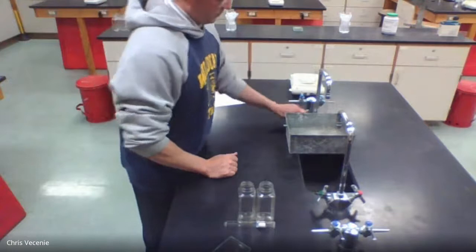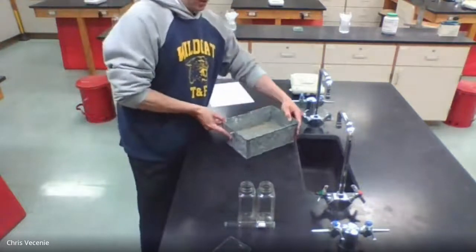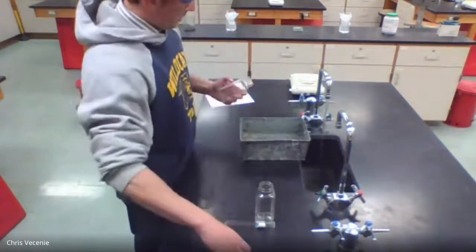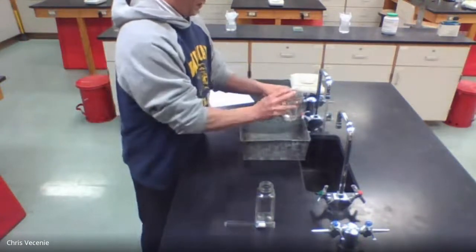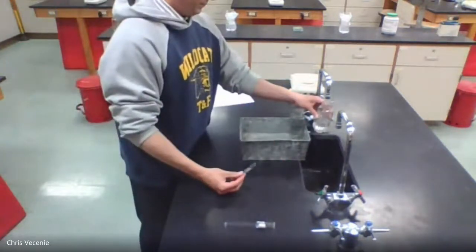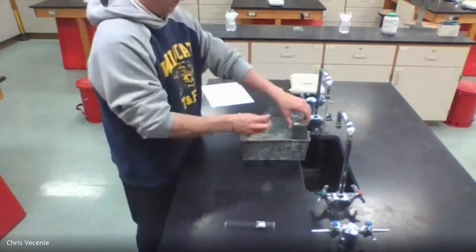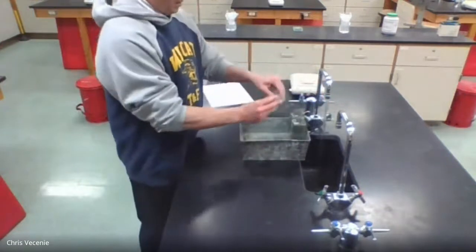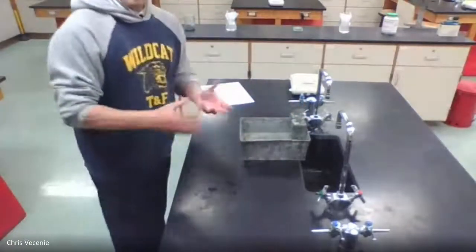So, just like always, I'm going to spin this trough around so that my release valve is facing over the sink. And then I'm going to fill my two bottles. And if you remember, we just overflow those, cover them up, and we dunk them. And the test tube, we just dunk onto the bottom. All right, so our collection area is ready.